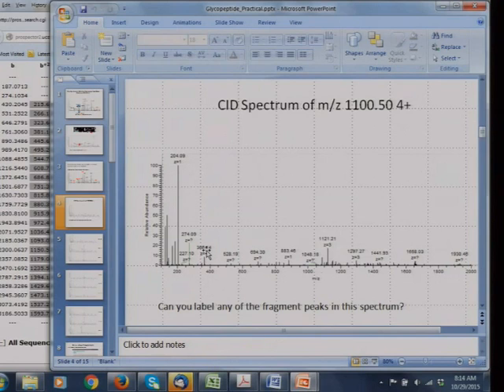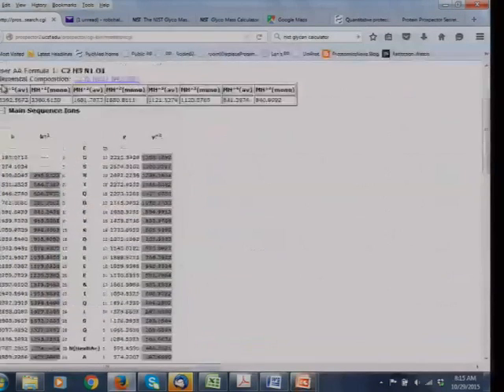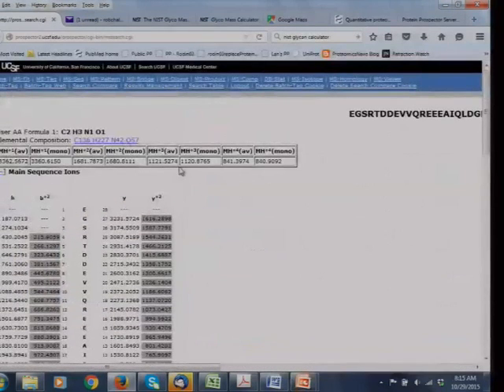And this 366 is the HexNAc-Hex. So that's another glycan fragment. And then the only other peak in here that I would expect you to be able to explain is this 1121. If you remember, the other big peak you should see is the intact peptide with the HexNAc still attached. And so we've got 1121.21. And up here, hopefully, it should be 1120.87.